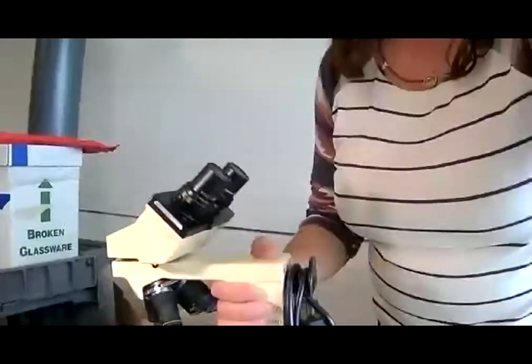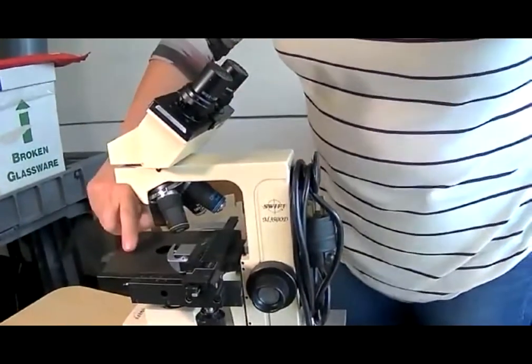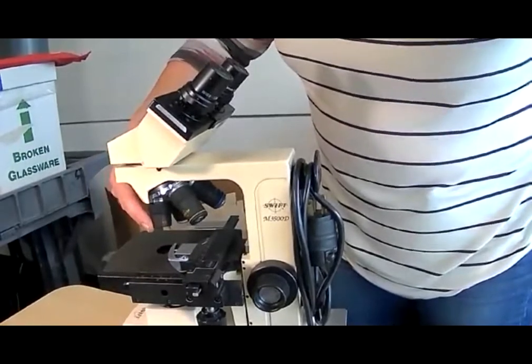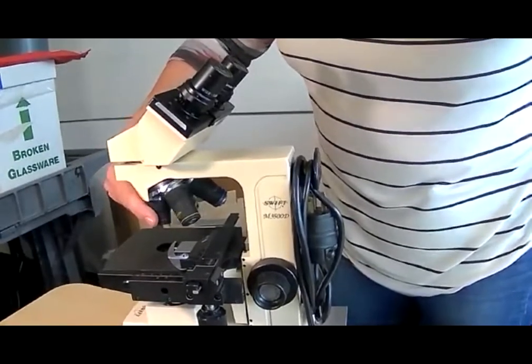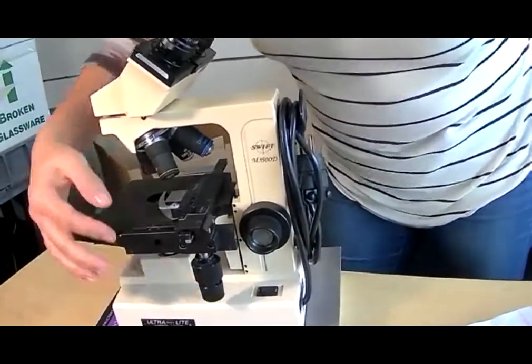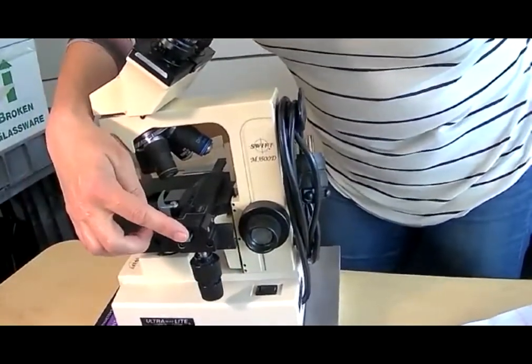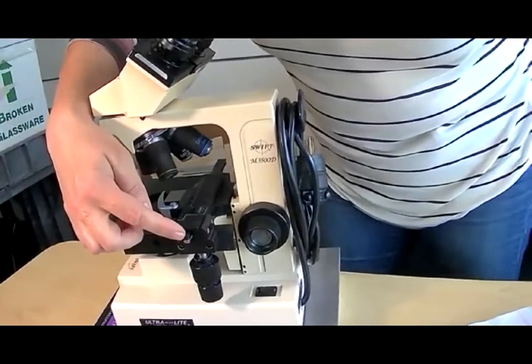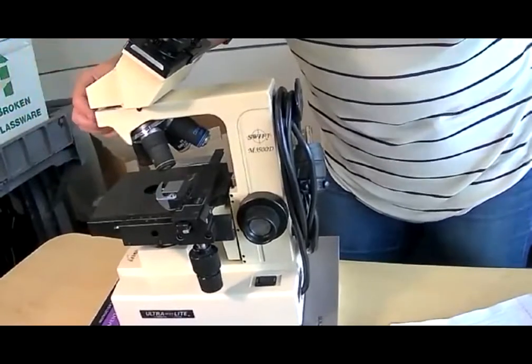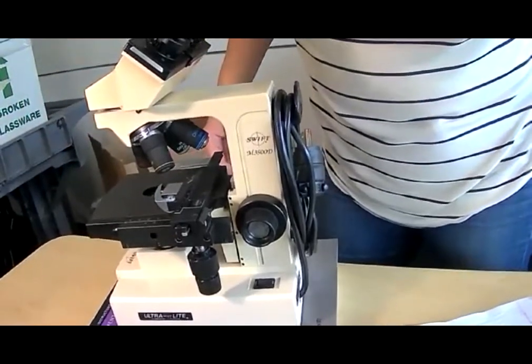You're going to lower the stage, put the smallest objective, which is the scanning objective, down, and use these knobs to center the stage. So again, this arm is not sticking out. Those are all the processes involved in putting up a microscope correctly.